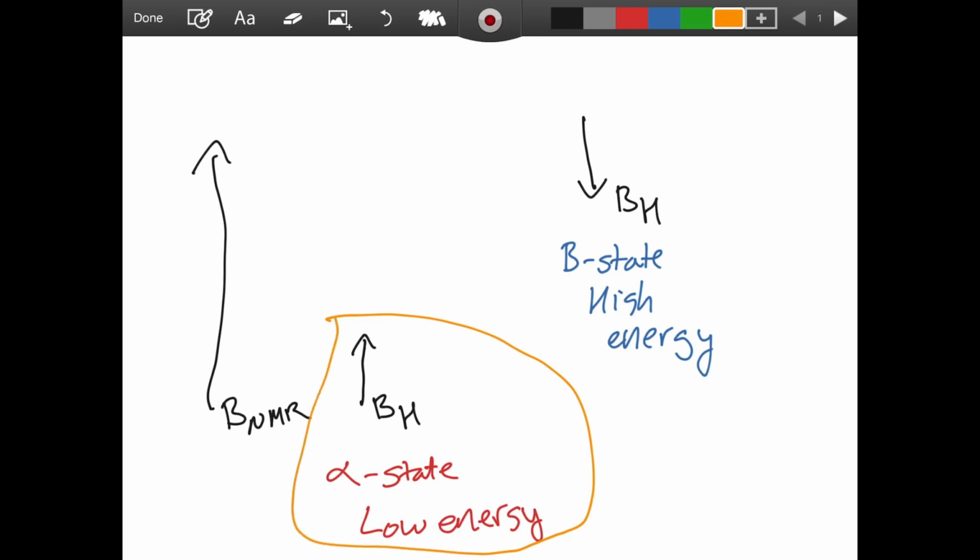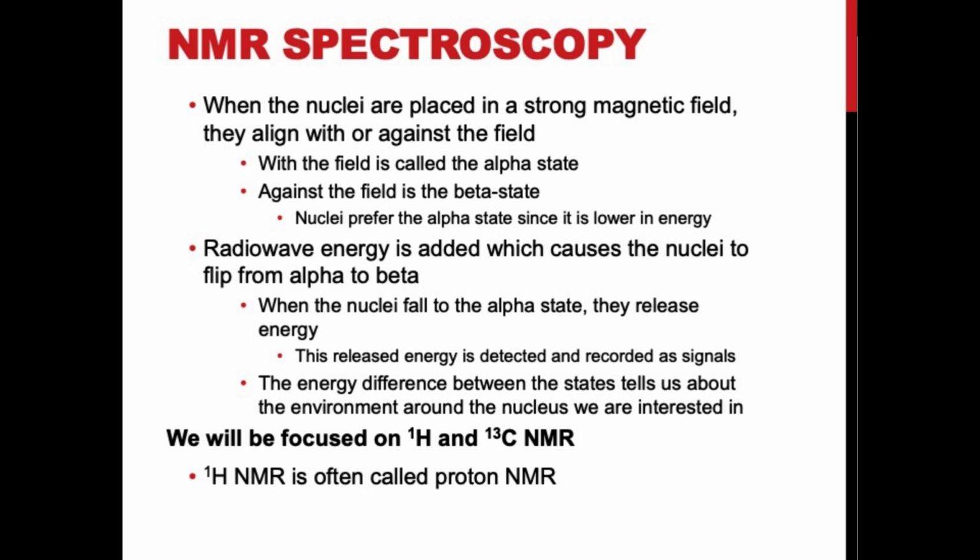So you drop your sample in, you have your magnetic field from the NMR, and then all the magnetic fields from all of your hydrogens line up together and point in the same direction. So this is kind of like when you have two magnets and they have a north and a south, right? If you push the north pole and south pole of two magnets together, they go together because those fields are pointing in the same direction, right?